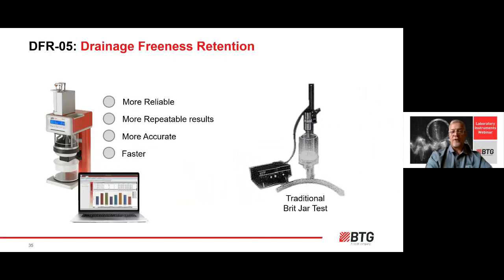And the grainy old picture on the right is just perfect, because I found one of these in a lab that I'm not sure anybody had been in for a while the other day. We sort of got it running. And after we did, we were looking around and said they really could use a DFR in here, because this mill is moving ahead with all kinds of advanced measurement around controlling refining levels, controlling charge and strength additives. Wouldn't it be nice to know what we can expect for retention and drainage rate when we switch over to this chemistry?